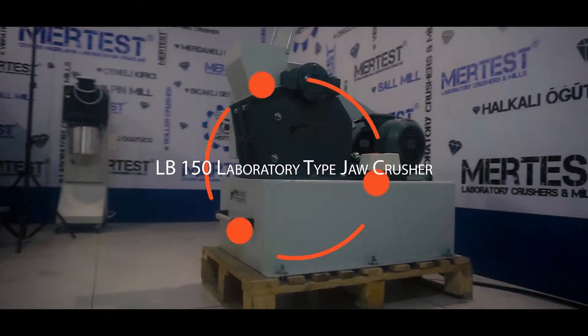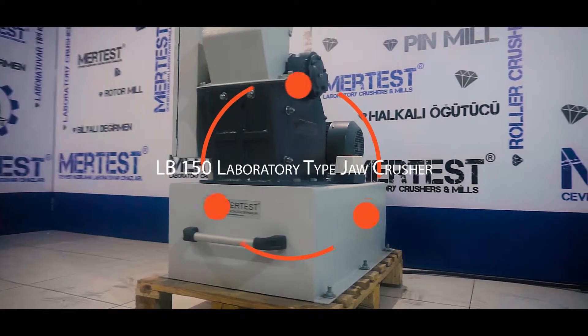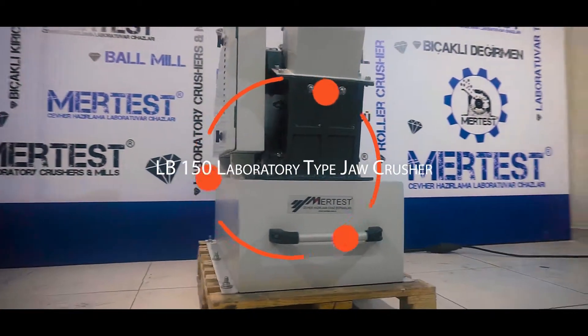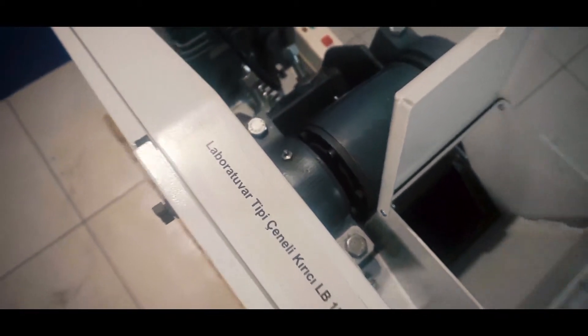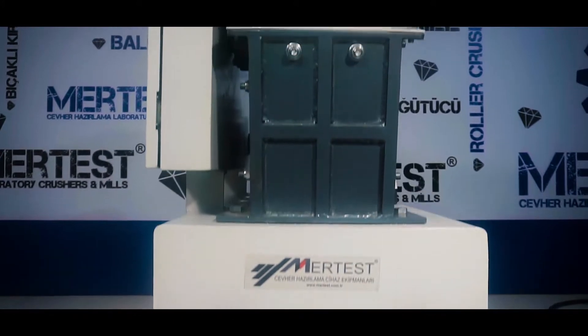LB150 laboratory type jaw crusher is the machine which is used for breaking very hard material into a certain grain size, like minerals, chemicals, glass, and etc. It is a preferred type of crusher for the first crushing process.